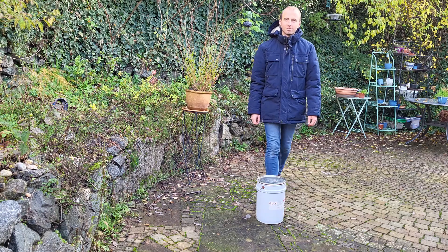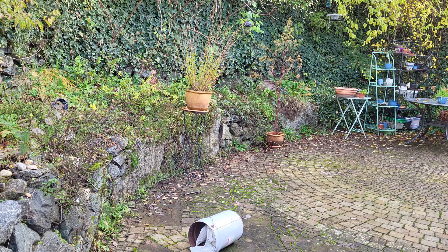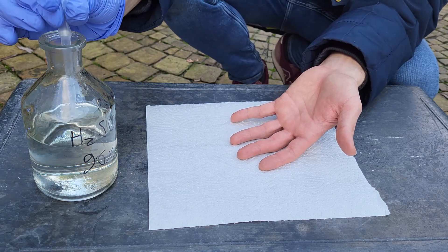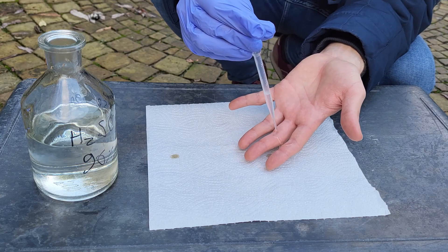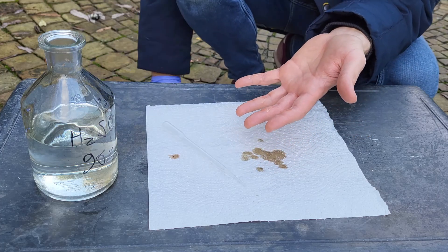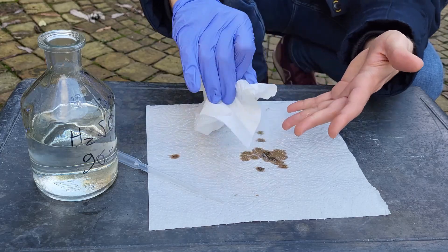You should definitely avoid getting this acid on you, because it won't be pretty. By definition, a super acid is any acid stronger than concentrated sulfuric acid. To demonstrate this, let's pour some concentrated sulfuric acid over my skin. You can see that my hand survives this no problem, but the paper towels beneath get eaten, proving it is real concentrated sulfuric acid.